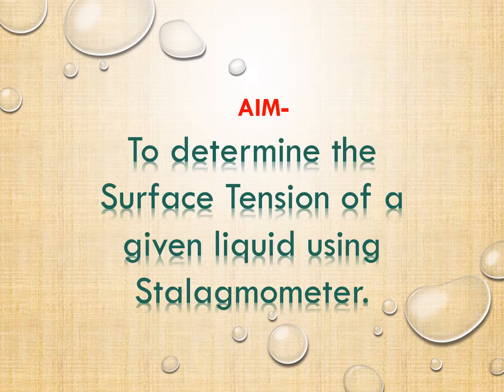Hello students, today we will see the experiment of surface tension. Aim of the experiment: to determine the surface tension of a given liquid using a stalagmometer.